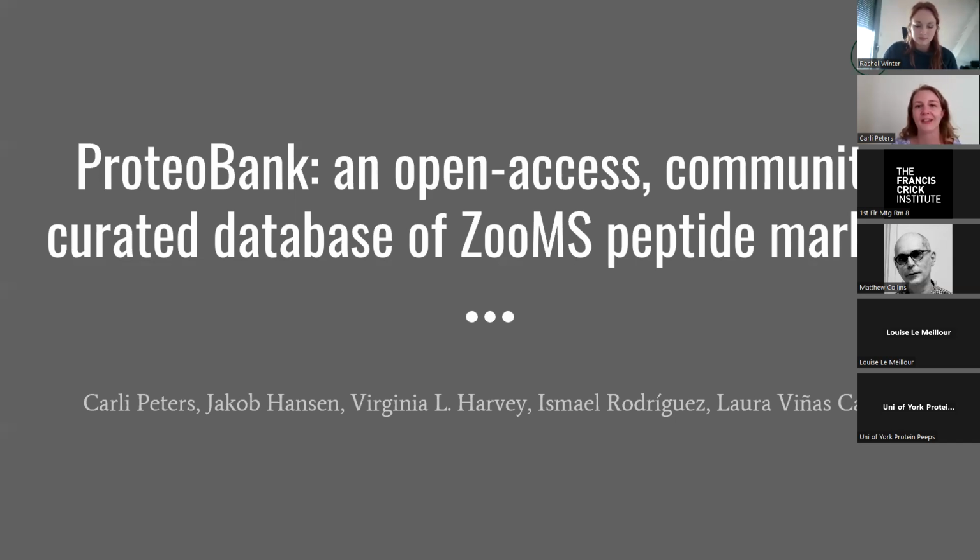So I'll be presenting on behalf of one of PAASTA's community projects, which is ProteoBank. And with a group of people, we're developing an open access community curated database of ZooMS peptide markers, specifically focused on collagen.